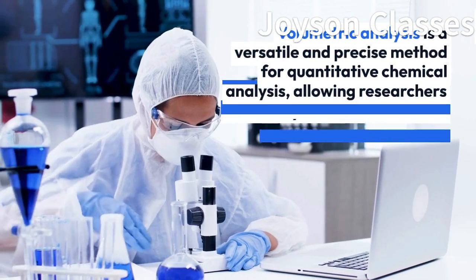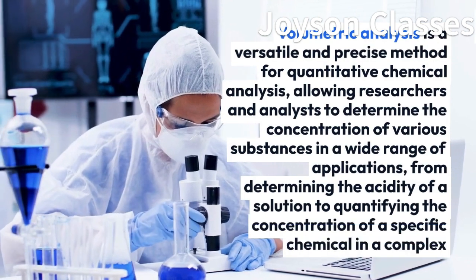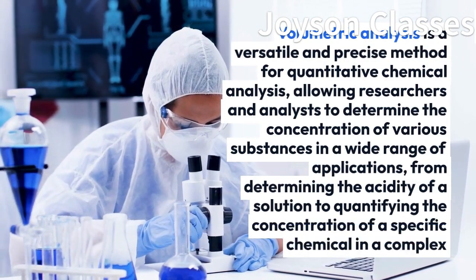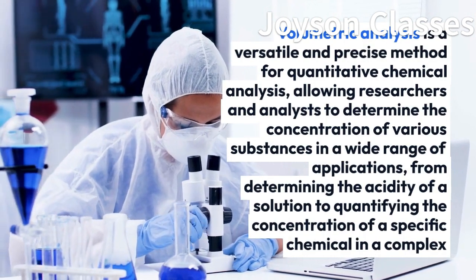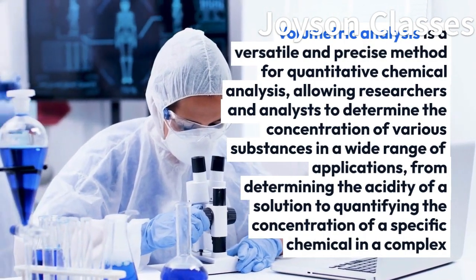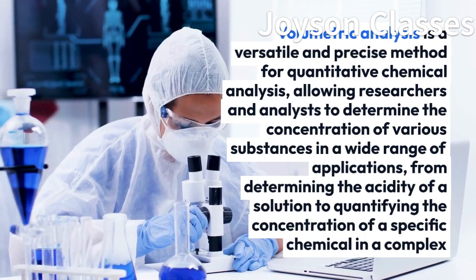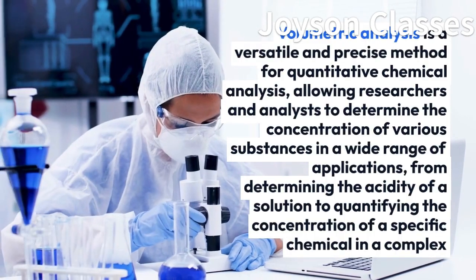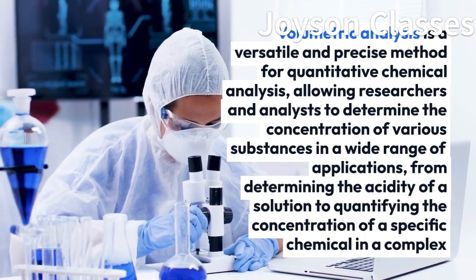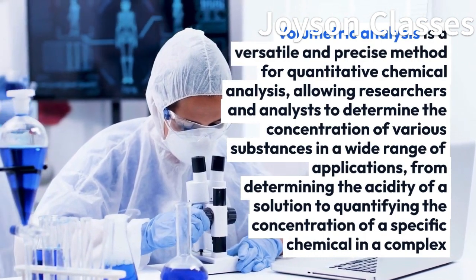Volumetric analysis is a versatile and precise method for quantitative chemical analysis, allowing researchers and analysts to determine the concentration of various substances in a wide range of applications, from determining the acidity of a solution to quantifying the concentration of a specific chemical in a complex mixture.